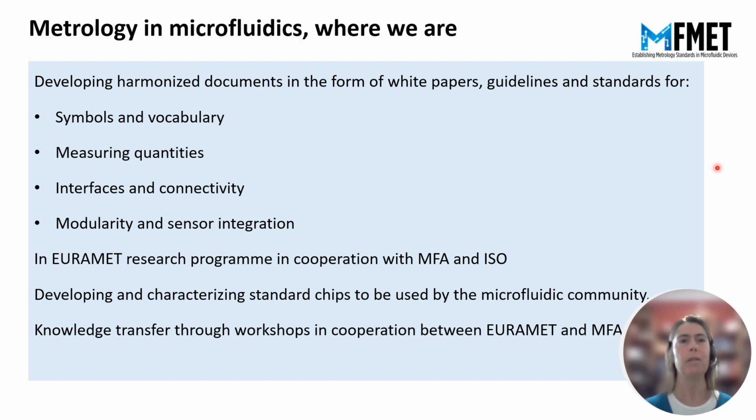So, regarding metrology in microfluidics, where are we? We are developing harmonized documents in the form of white papers, guidelines, and standards for symbols and vocabulary, measuring quantities, interfaces and connectivity, modularity and sensor integration. And this is done within EuroMet, the Microfluidic Association, and the ISO group.